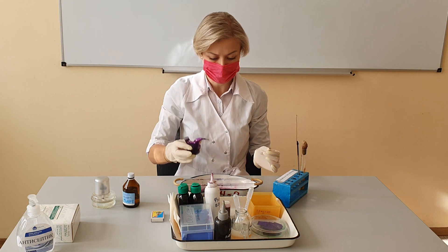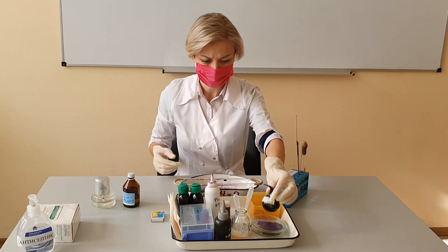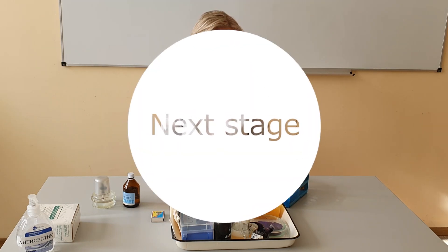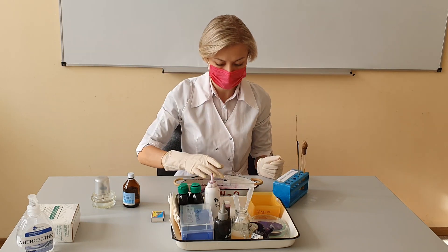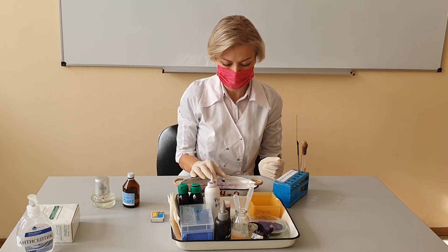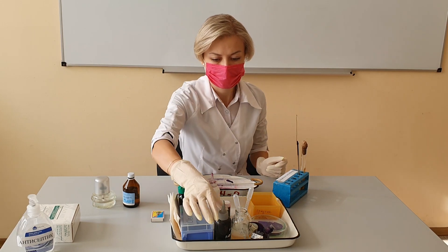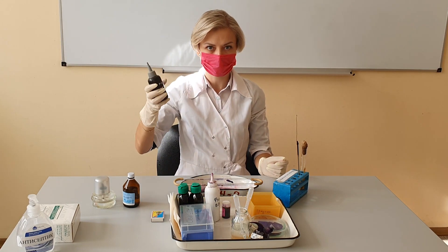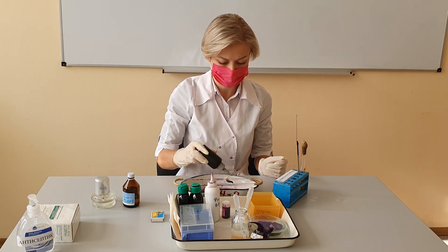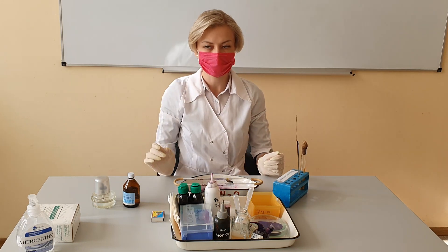Flood the slide with crystal violet and let it stand for about 60 seconds. Now, flood your slide with the iodine solution and let it stand about a minute as well. When the time has elapsed, wash your slide with water for 5 seconds. The specimen should appear blue-violet when observed with the naked eye.